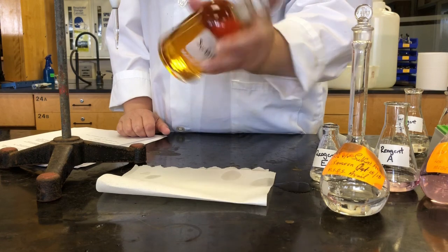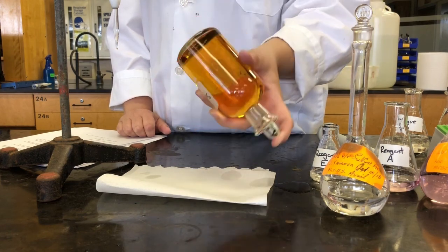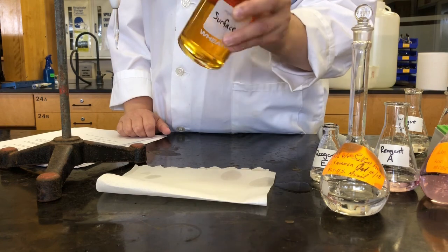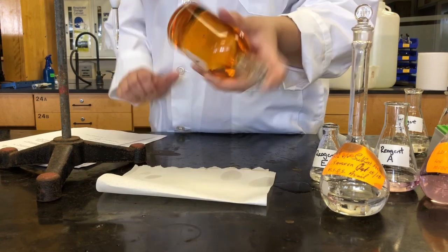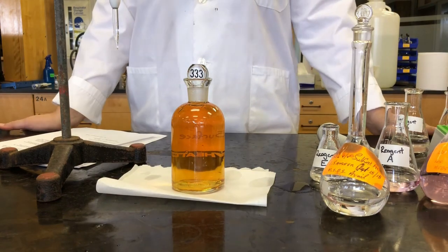And what we should be left with is a yellow, orangish color of the free iodine. There we go. There's still a few little particles in there, but that's the debris from the water. There we go. So the precipitate is all dissolved. So now we're ready to start our titration.